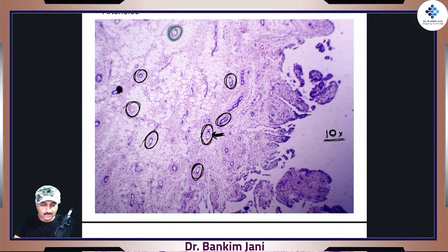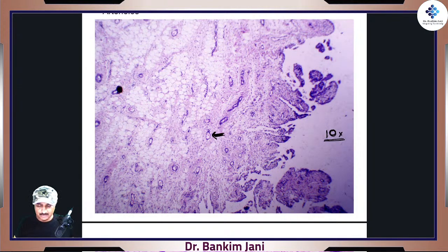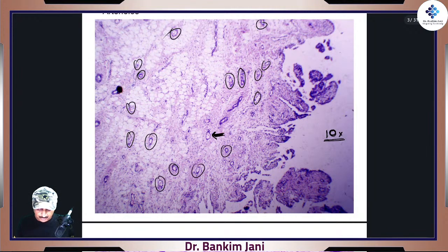suddenly you'll start watching. Your brain would start, if I remove all these markings, your eyes would start seeing that yes, there are so many arterioles. This one, this one, this one, this one, this one, all are arterioles. So we pick up any one of them, and there would be these types of cells. So that's how it's arranged.